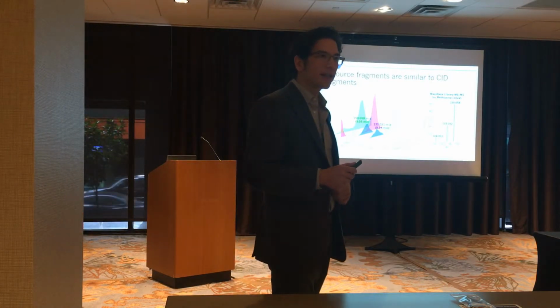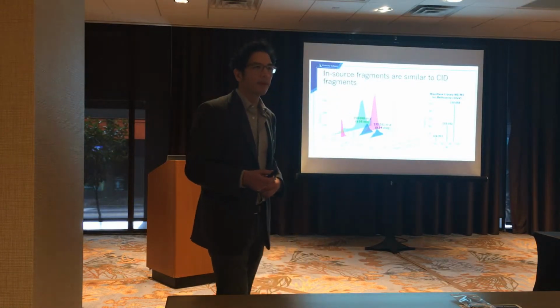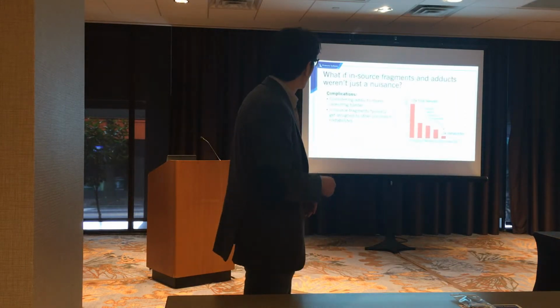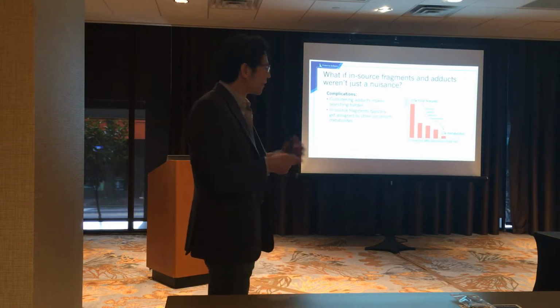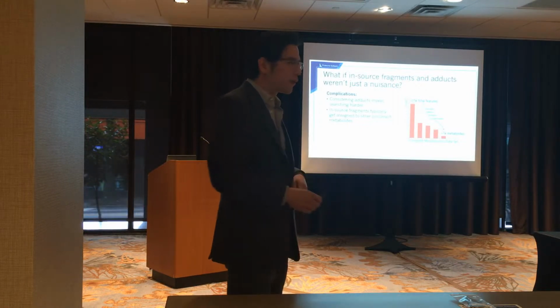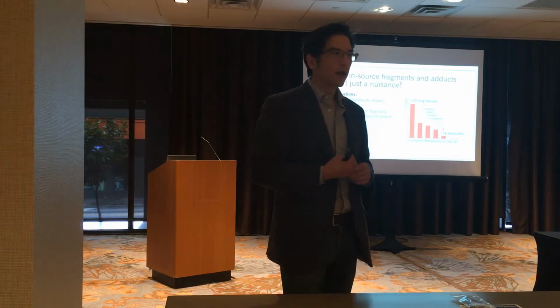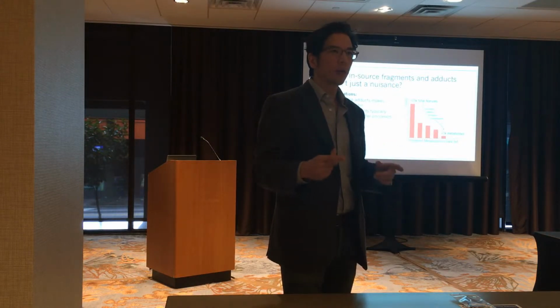So we started to see data like this, and we're wondering how could we actually leverage this? How could we make potentially detections out of the MS1 data as if it were MS2 data? And so these in-source fragments actually provide a lot of different complications for interpreting the data. So first one is, if you have to start searching with adducts, so if you start having to search with sodium adducts or potassium adducts or ammonia or something like that, every one of those will increase the search space.